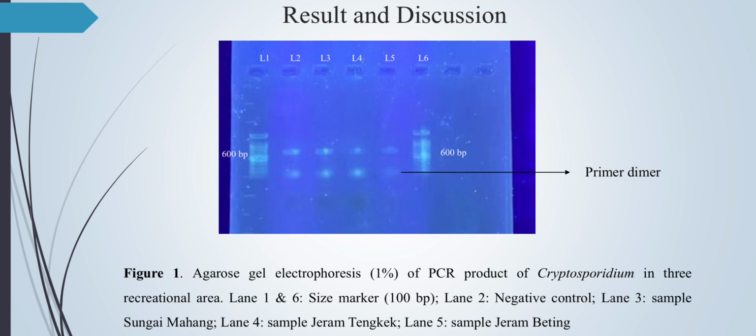This occurs because of poor aseptic technique, as nested PCR has a high chance of contamination, which can occur during the transfer of the first product into the second tube for the second round of amplification. Meanwhile, primer dimer appears and reduces the final yield of the target DNA product, as the primers anneal to each other rather than attaching to the target template DNA.